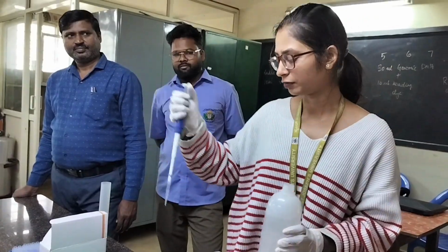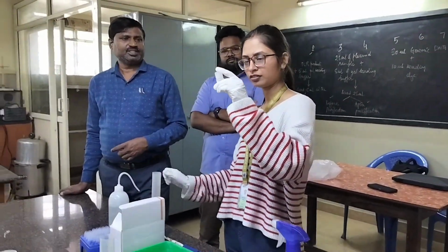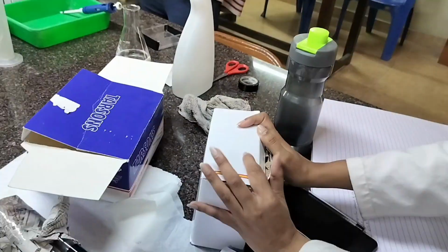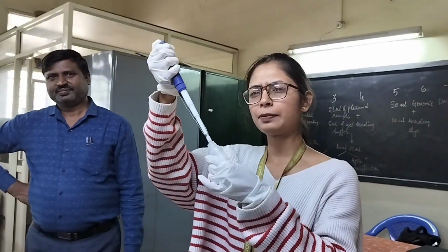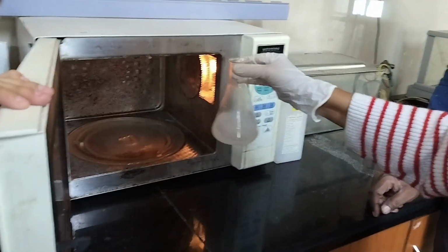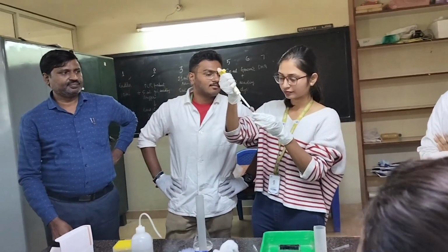Prepare 1x TAE by diluting the appropriate amount of 50x TAE buffer. We approximately require 200 ml 1x TAE, dilute 4 ml of 50x TAE into 196 ml distilled water. Weigh 0.5 grams of agarose and add 50 ml 1x TAE. This gives 1% agarose. Boil till agarose dissolves completely and a clear solution is obtained. Meanwhile, place the comb of the electrophoresis set in such a way that it is approximately 2 centimeters away from the cathode. Add 2 microliter ethidium bromide to the molten agarose.